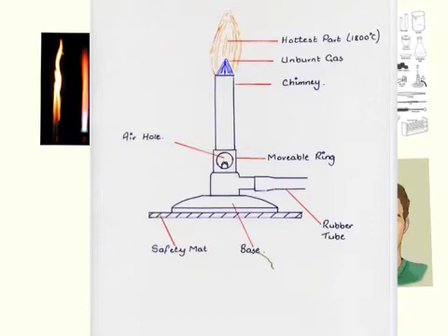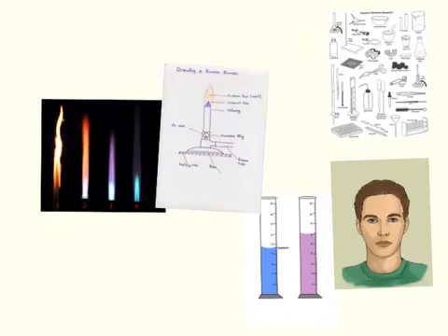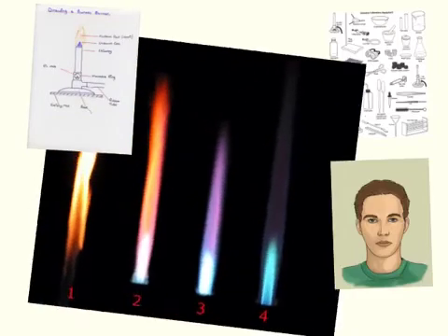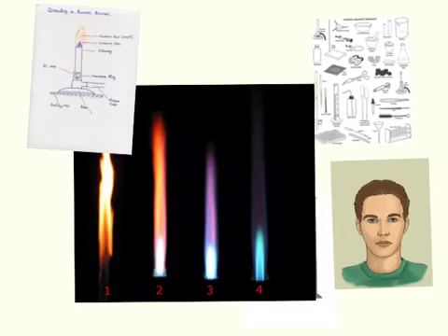is the different types of flame. So whenever we talk about the different types of flame, we have hot, a little warmer, warmer, and warmest still. Whenever this is the warmest, we have to always consider this. Whenever we see the blue flame and it's kind of translucent in the back end, that's as warm as it gets. Sometimes you see little flames of yellow going through, but generally that's the way it goes. The hotter, the more clear, the more blue. Alright, so there it is.